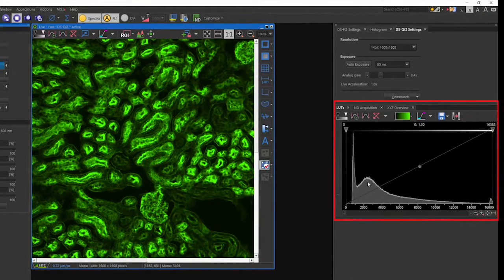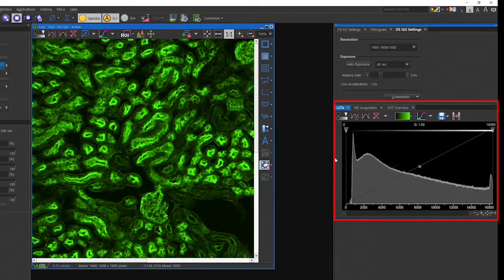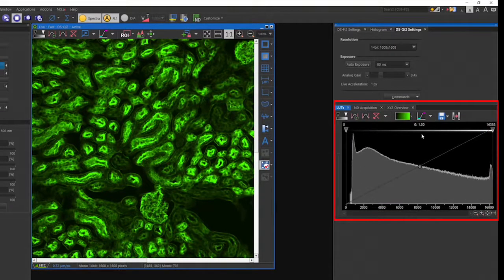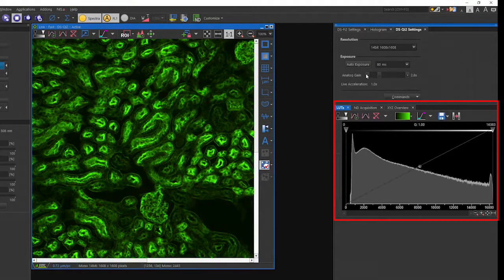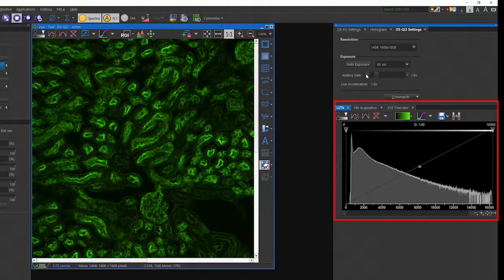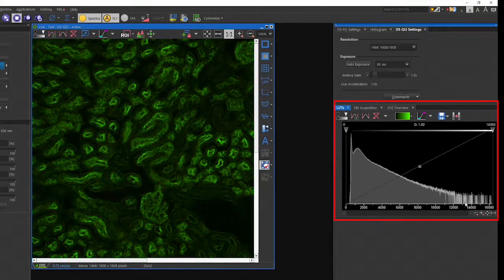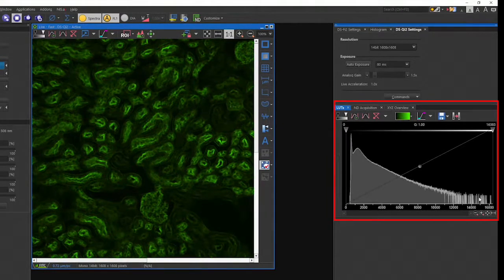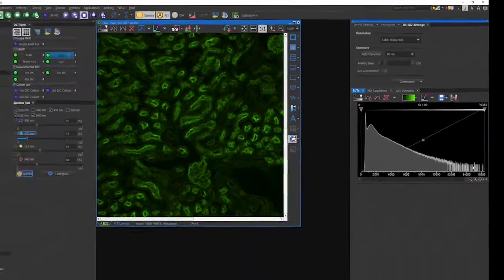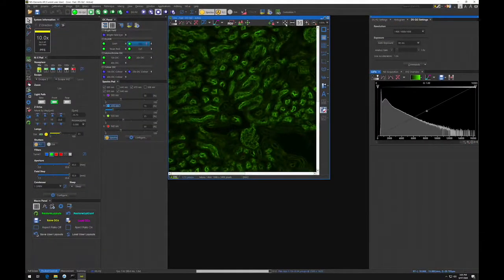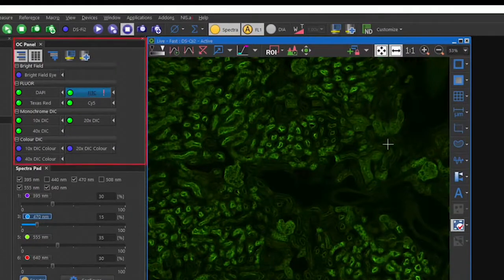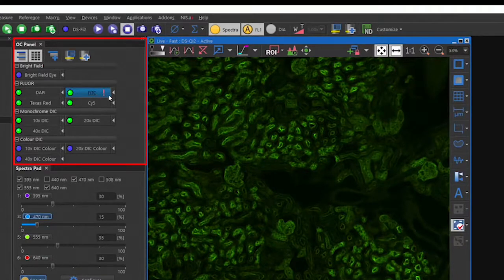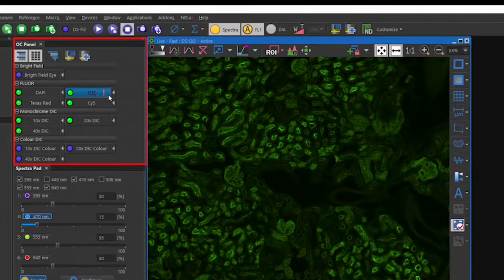Use the lookup table to help determine when you have found optimal settings. You don't want any saturated pixels. This may be easier to see by sliding the slider next to the lookup table to change from a linear to a log scale view of the histogram. Once you have optimized your settings, you will see a red exclamation point on the FITC OC indicating settings have been changed. Press the arrow next to the OC to save them into that OC.